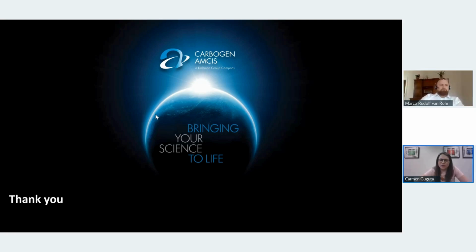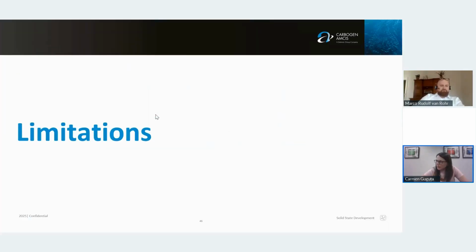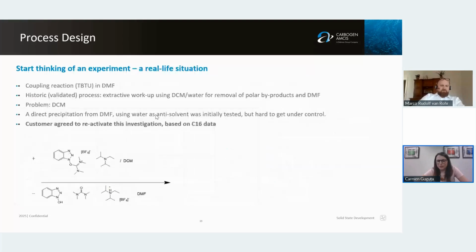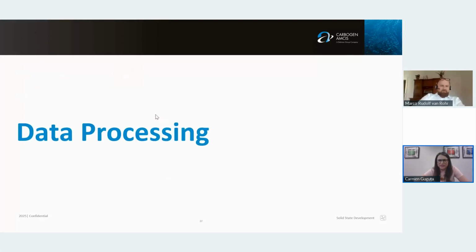I do believe you have quite some experience with it. Are there any ways on how to go around it or to minimize it? I'm asking this because just in the morning we had a question from a customer from Japan related to agglomeration, and I also have a bit of experience with it. It's also sometimes compound related. Yes.